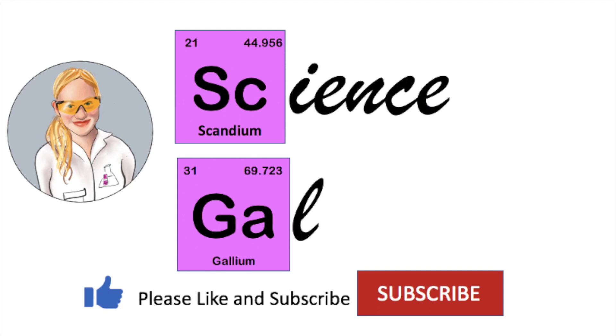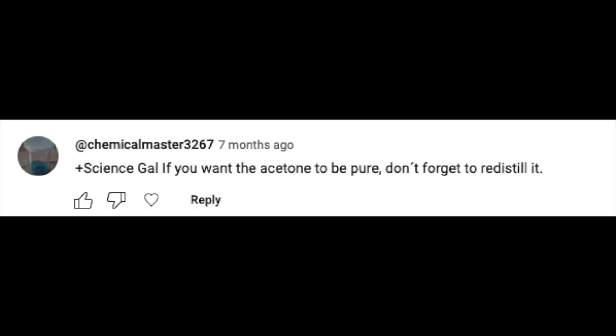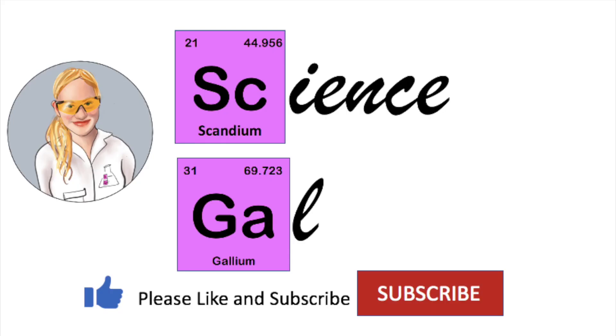Hello, I'm ScienceGal. In this video I am doing a fractional distillation of the acetone I made in my last video. I would also like to thank ChemicalMaster3267 for motivating me to complete this video. Now let's get started on the distillation.